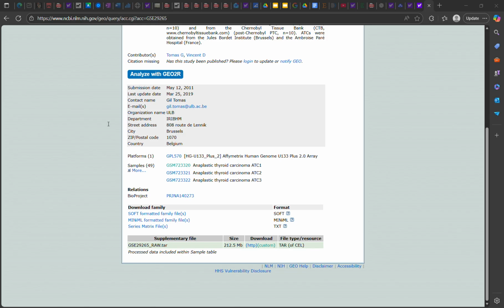And now we've got that. Let's go to feature data, see if it's any different. Yep, and here you go. New feature data, just got the 2 columns.